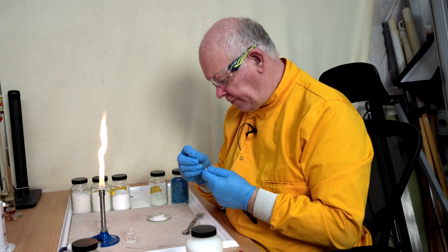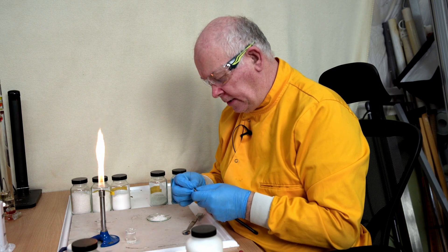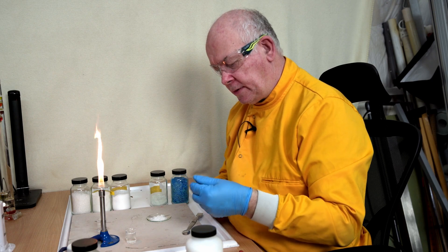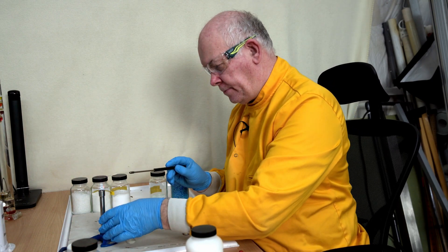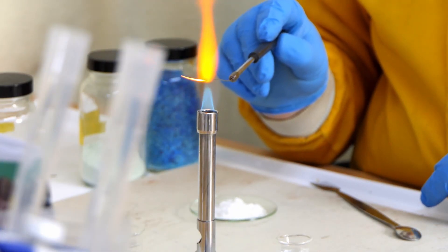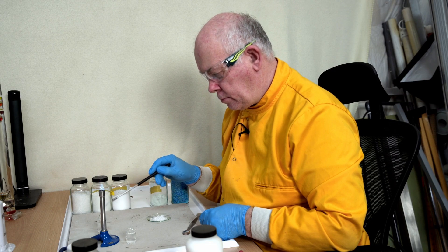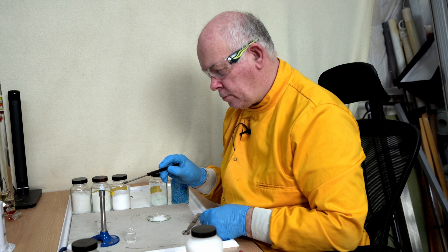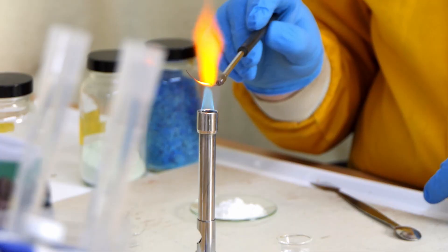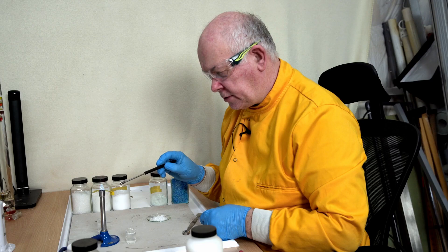Potassium is a very interesting metal. When it burns, it burns with an interesting colour flame. So let's clean this off and make sure there's not too much contamination.